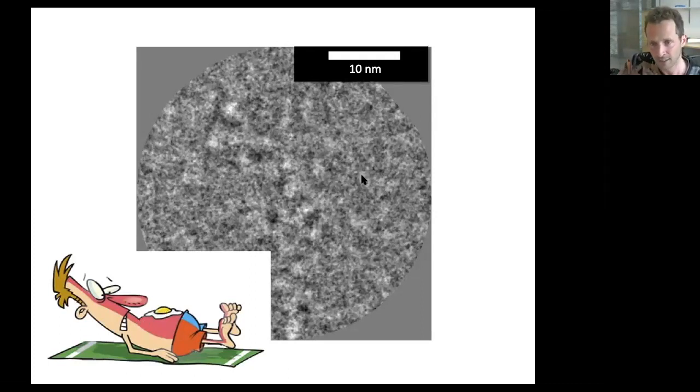So in the electron microscope, we only use very short exposures with a limited number of electrons to get these images. And then simple counting statistics, for example, together with the relatively low contrast between the protein molecule and the surrounding water, result in these images where you have a large amount of noise.